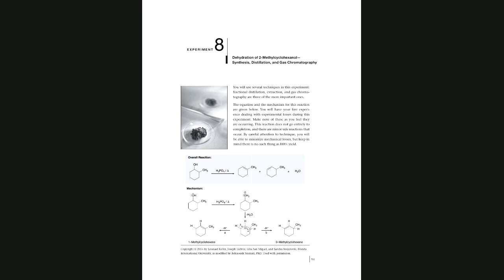You could search online. You could search the CRC, the Chemistry and Physics Handbook, which I showed you at the beginning of the semester. It is a very thick book, and I have one old copy here. So if you have a structure for a molecule, you have a physical property for that molecule, and you find it here. What should be the melting point, for example, or the boiling point, and then you measure the melting point or the boiling point.